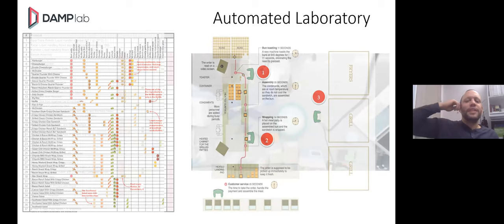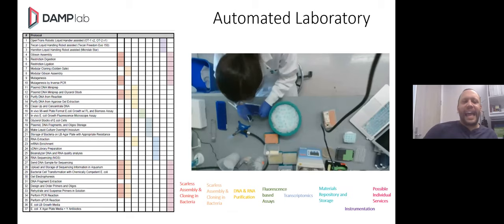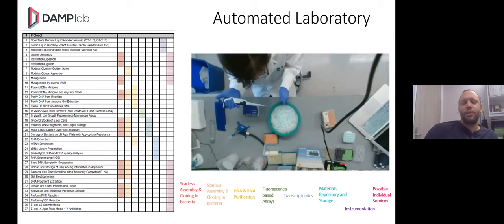So the damp lab has something similar. We have these 8-ish, 9-ish classes of protocols shown by the different colors. So the different colors represent the different protocol classes that are shown in the bottom of those labels. We can say, given those, what resources do they require?